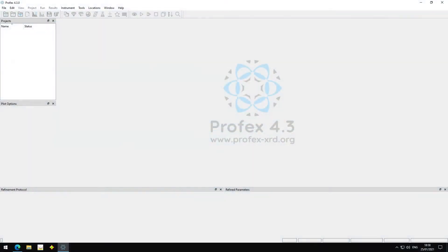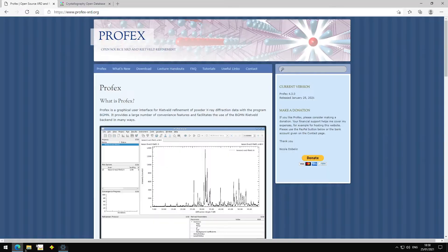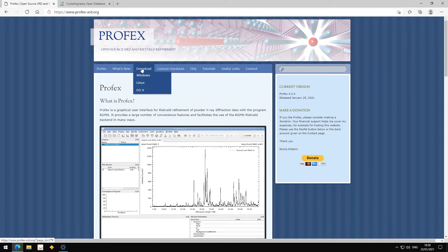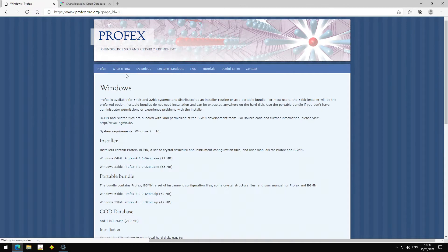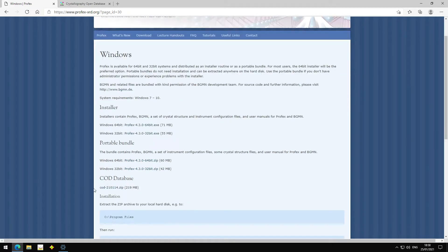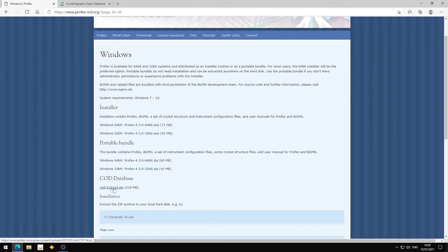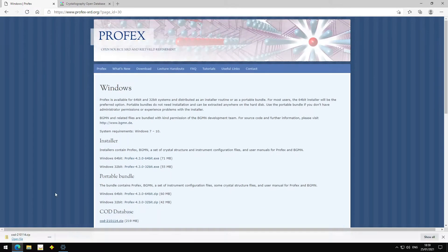We need Profex version 4.3 or later, and we can download it from the Profex website, from the download section. But here we also need to download the COD database. There is a compressed file, 219 megabytes at the moment. So we download this.